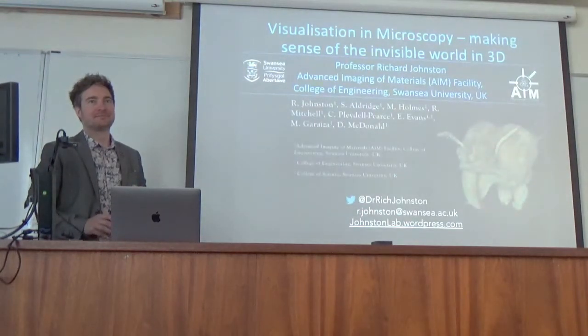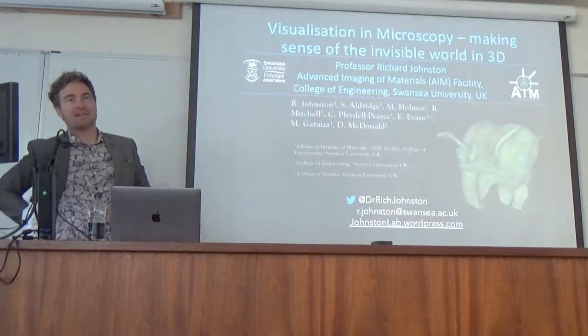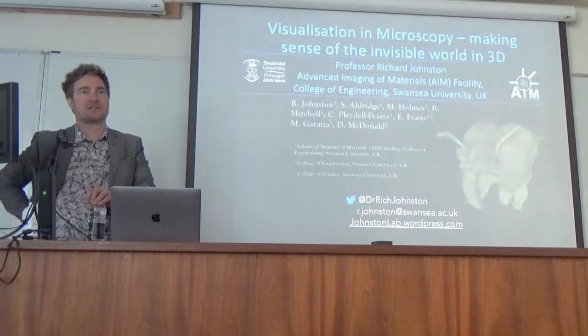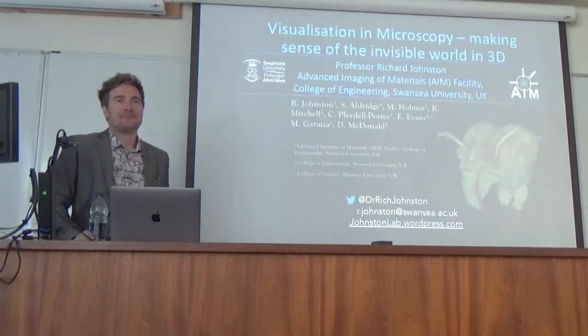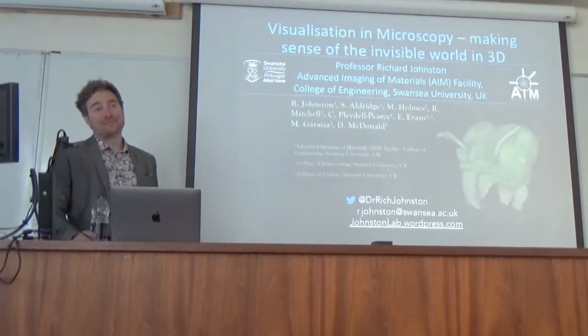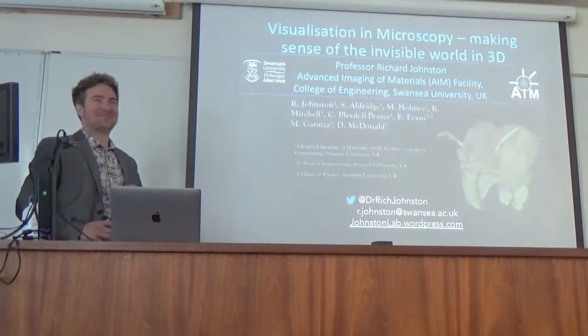What was that last object? That was Cuttlebone. Yeah, like the maze, but just volumetric data. Very little processing of the data. It was visualized in Drishti, so it makes it look nice. Yeah, it's a good biomimetic, but it seems that it's essentially 2D. I wouldn't have known that until I saw your fly through. Frustrating.